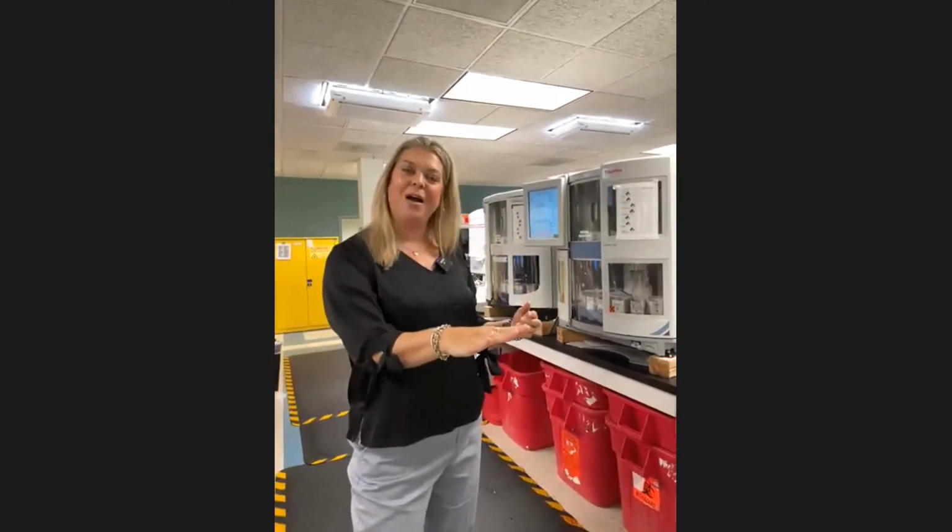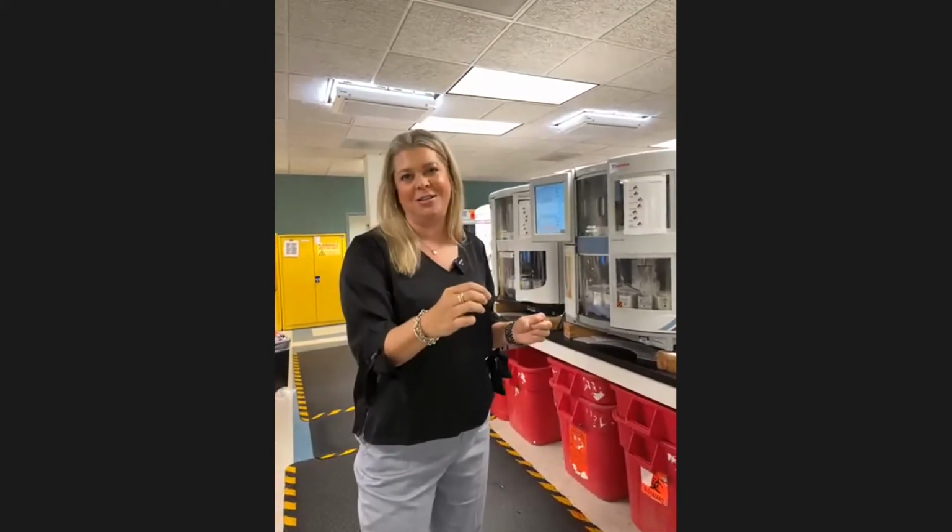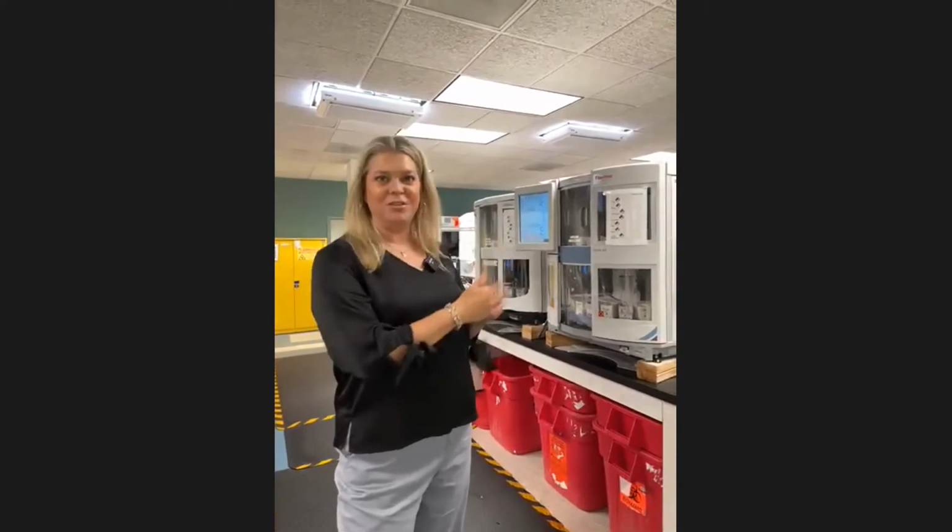Tissue gets embedded in paraffin wax, gets cut over on a microtome at very thin sections, so thin they have to put it on a water bath. Then they pick it up with slides. And once it's on the slides, they bring it over to the stainers, and the stainers put stains on them. And that's it for light microscopy testing.